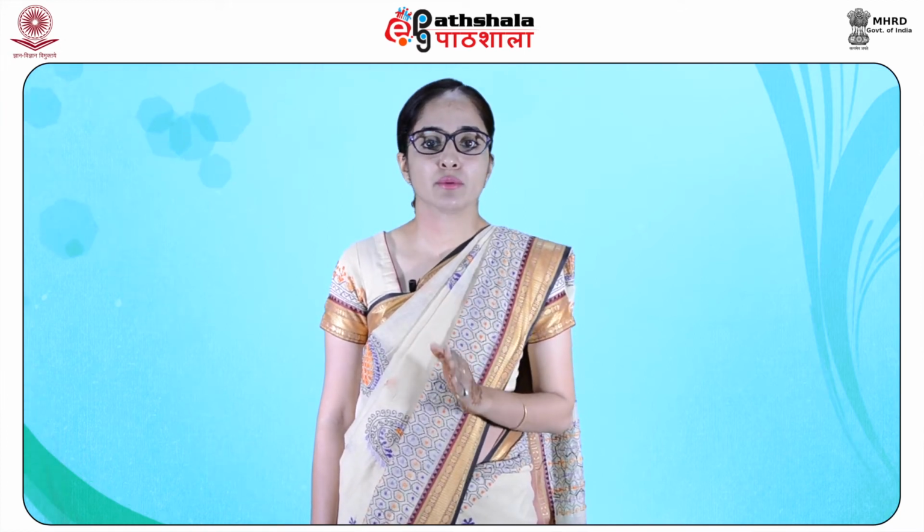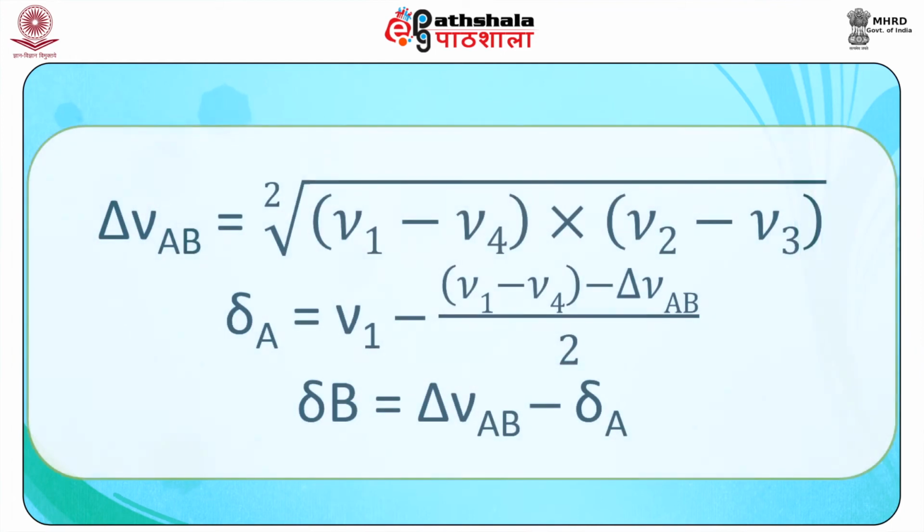The chemical shift values can be calculated by a mathematical formula, like delta nu AB is equal to square root of (nu1 minus nu4) multiplied by (nu2 minus nu3). Now, in this case, delta A will be equal to nu1 minus (nu1 minus nu4) minus delta nu AB divided by 2. Thus, delta B here will be delta nu AB minus delta A.